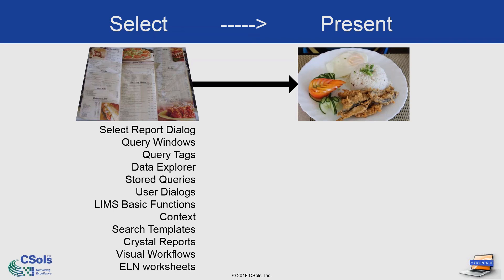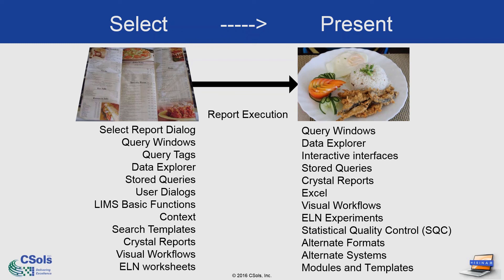On the selection side, you can see a list of different areas we'll discuss, starting with the select report dialogue, query windows, query tags, and more. We'll then move on to briefly talking about report execution and ways of refining and improving that for your lab. And finally, presentation of the data — I'm using a lot of the similar tools as on the selection side, but for the purpose of presenting, so a lot of these options can be combined and reused.